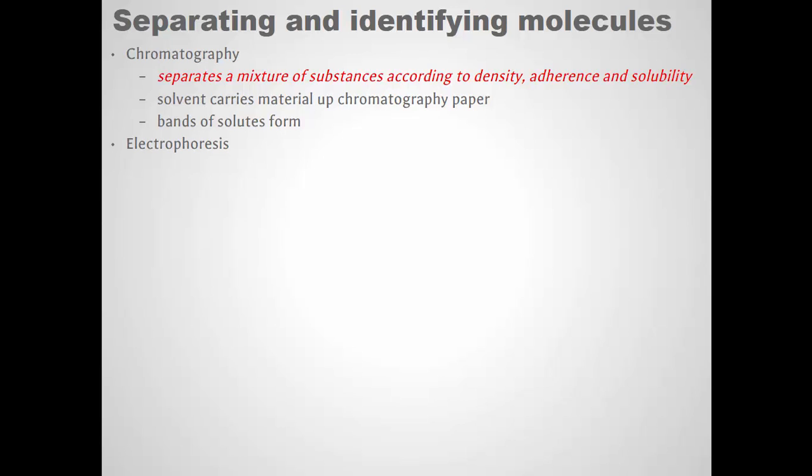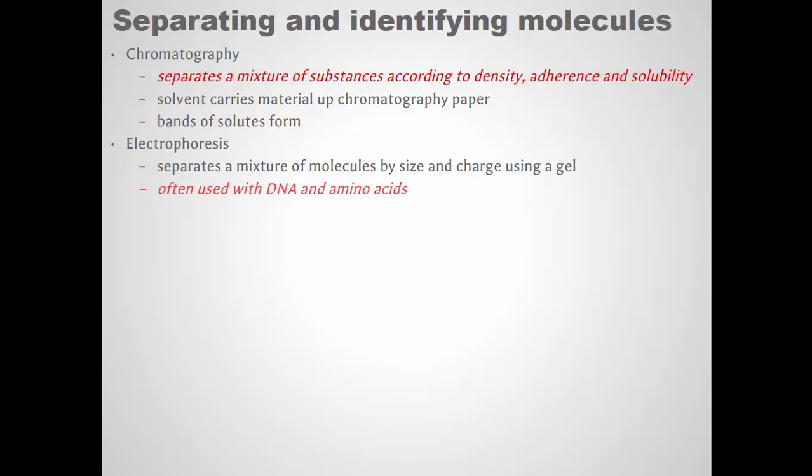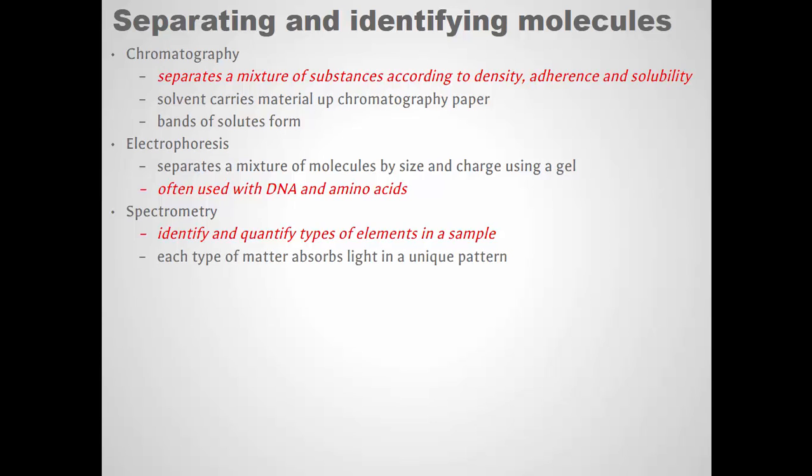Electrophoresis, this is an electrophoresis chamber. We'll use this when we get to our genetics unit. Electrophoresis is a way of separating DNA fragments from each other, or maybe amino acid fragments. If you've ever heard of DNA profiling or a DNA fingerprint, those are sometimes created using electrophoresis. Spectrometry is a way of analyzing which elements make up a certain unknown material. A mass spectrometer is used. You can have an unknown sample, and the readings that come back tell you it has 64% nitrogen, 22% phosphorus, and give you a reading about what it's made of. That's because different elements absorb light differently.